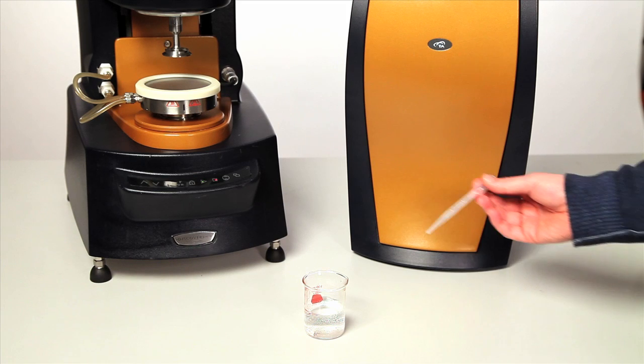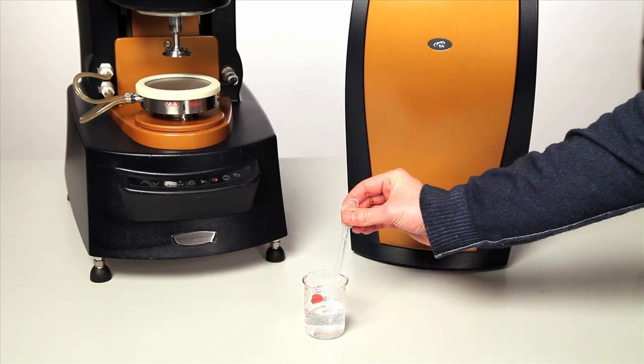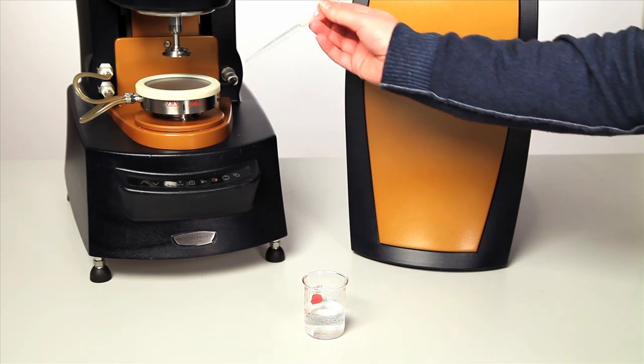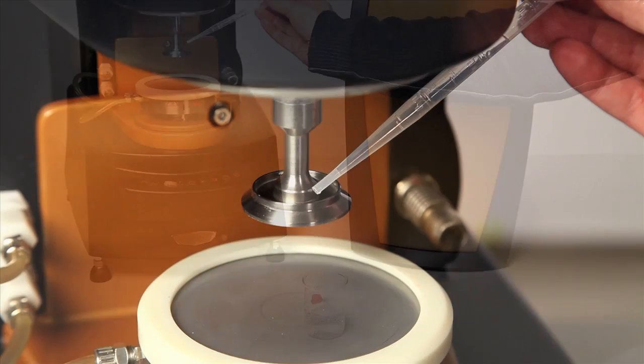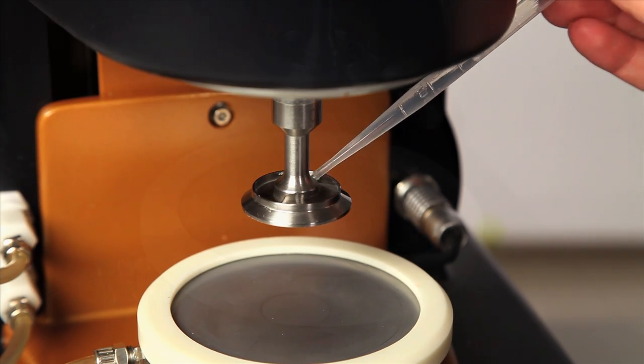Before performing the geometry inertia calibration, it is recommended to fill the well with a proper solvent in order to take the mass of the solvent into account. You can do this with a syringe or a pipette. Make sure the whole surface of the well is covered when you do this.